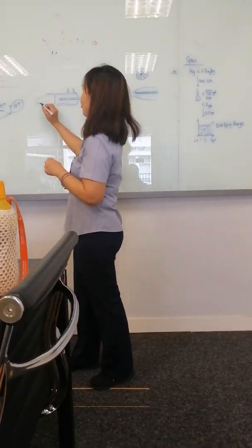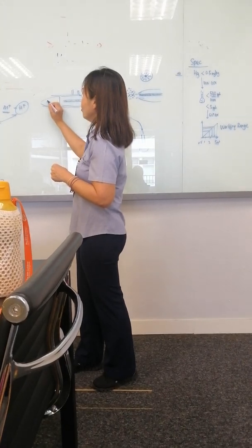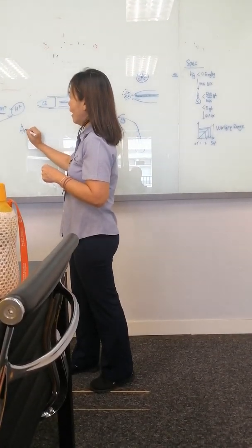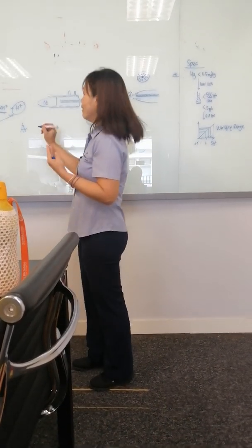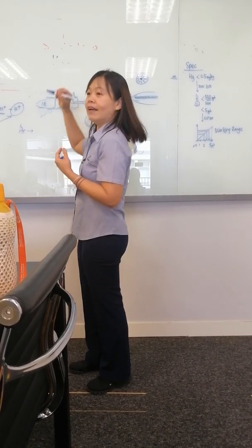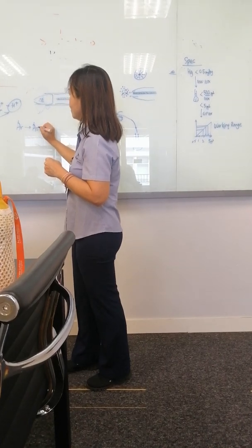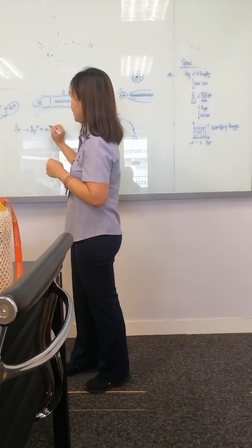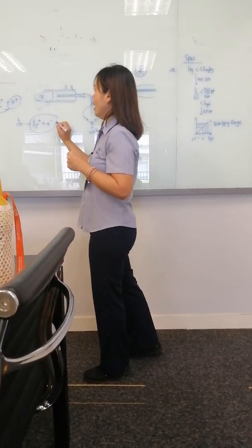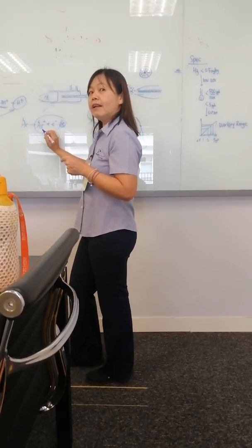Maybe I want to ask you, do you all know what plasma is? Plasma is actually a zone that is highly energized. It is energized because you are using argon gas, you take your raw material, argon gas, and then because you have the RF generator here, you have the load coil here, you actually create what is called plasma. When I say plasma, it is this. So plasma is actually a highly energized gas. Argon.